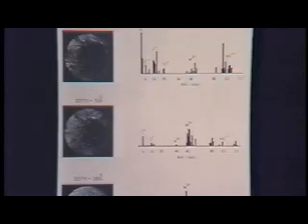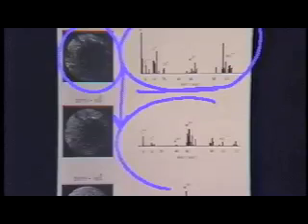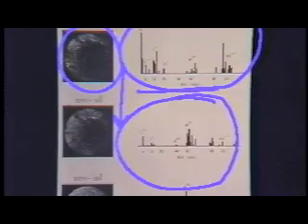Turns out to be a severe materials problem. And here's an example in which we have a field ion microscope pattern of a damaged surface as a result of being exposed to plasma species. And as we field evaporate successively and take mass spectra at the same time, we determine compositional changes as a function of depth.